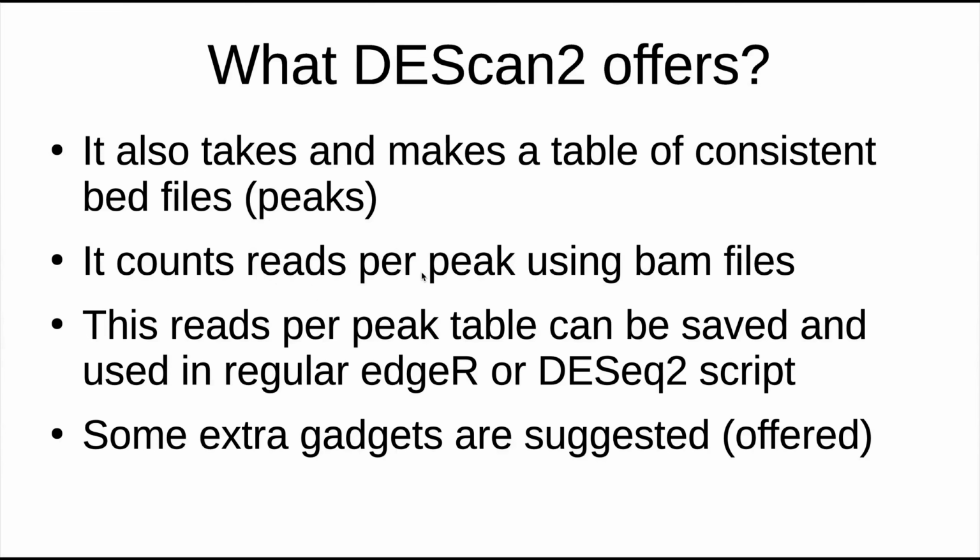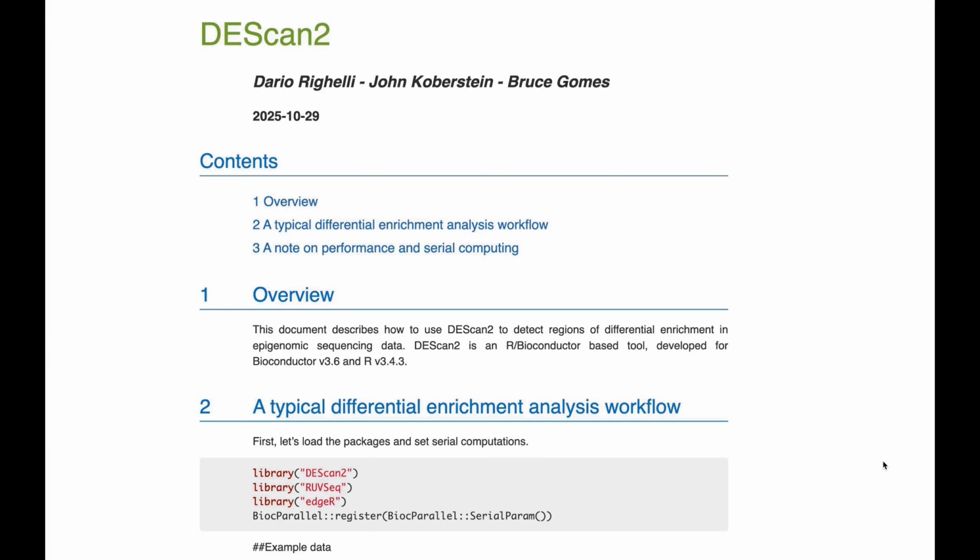After creating this read count table, you can save it and then use the regular edgeR or DESeq2 package by yourself, using your common knowledge. And of course there are some extra gadgets and suggested options to the regular edgeR and DESeq2 protocol. You can take it or leave it, it's up to you.